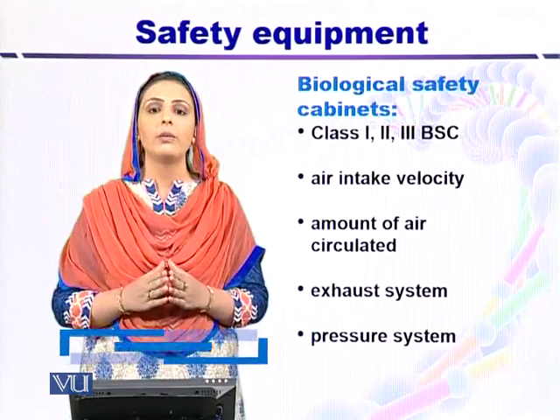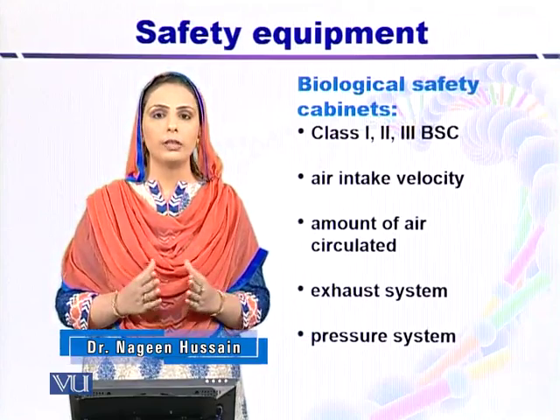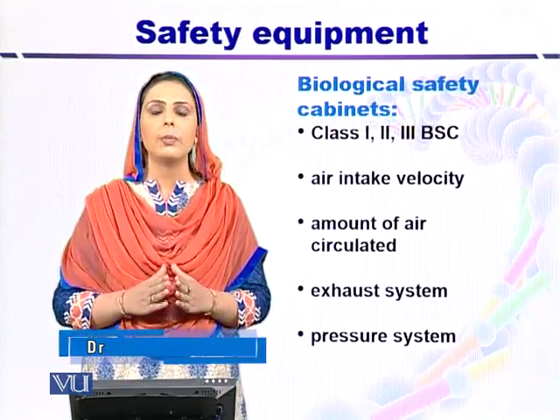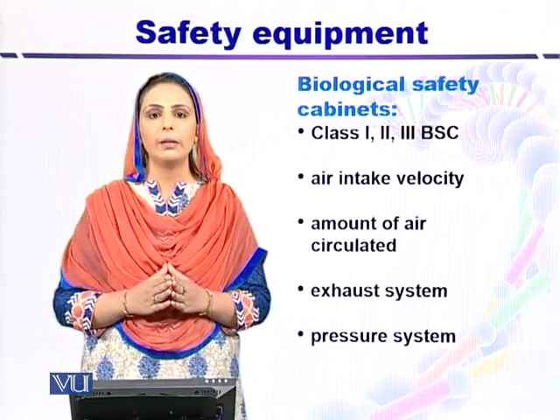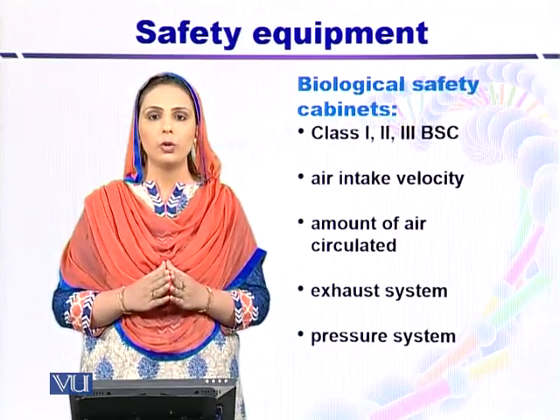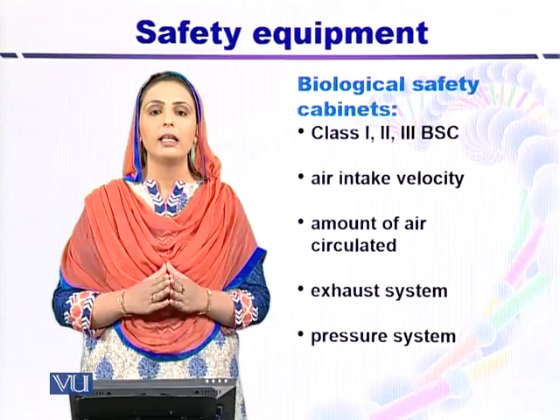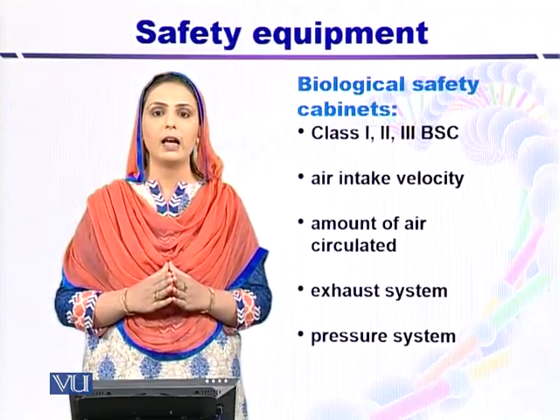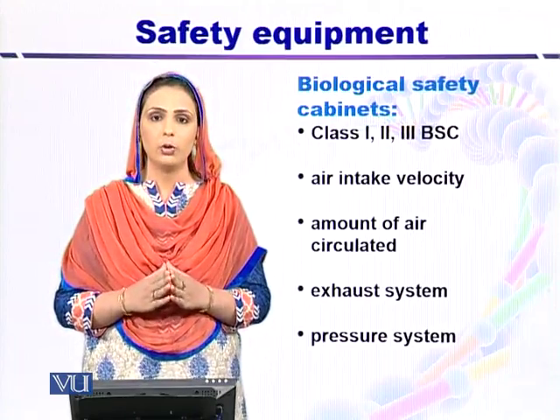in the lab which is dealing with the infectious material, we make use of the exhaust system as well as of the pressure system. So biosafety cabinets are highly applicable in the labs where risk group 4 is also used, means the pathogens are highly dangerous for human beings. So biosafety cabinets should be used in order to protect the worker from the aerosols.